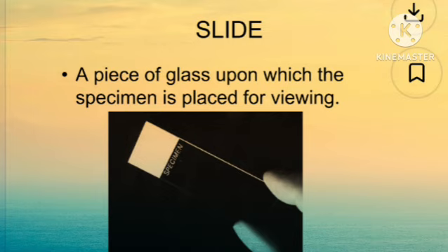And next, the slide. A slide is a piece of glass upon which the specimen is placed for viewing.